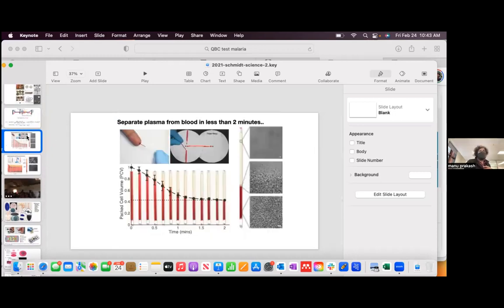So the first thing that's important is, when we can do something like this, what this allows us to do now is to optimize the parameters of how large the length should be, how large the disk should be. And then we kept optimizing to a point where we broke the world record for fastest spinning object with human power. So at this point, the optimal version of this object, does anybody want to guess? I think you would guess the yo-yo was 5,000 RPM. What do you think? How fast can we go when we've optimized this? 6,000? 10,000? We can go 125,000.